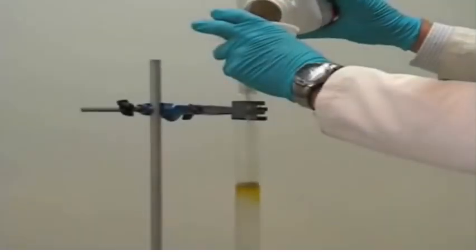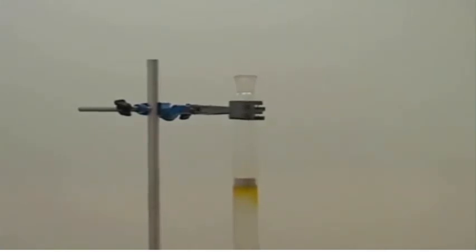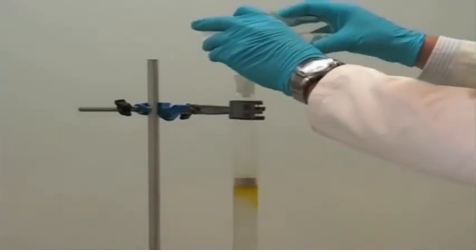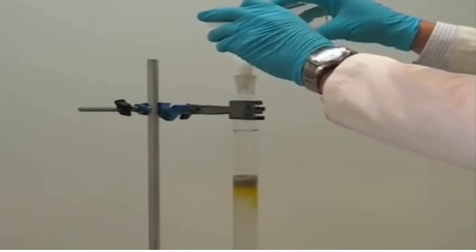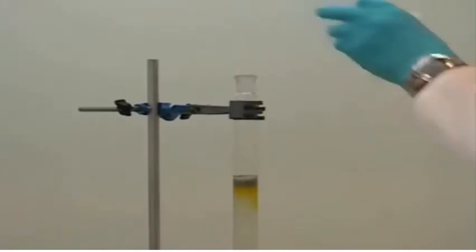Now we add some sand to a depth of about 1 centimetre on the top of the column. This will protect the silica as we add eluent. And here you can see us topping up the column with eluent. And we're now ready to run our column.